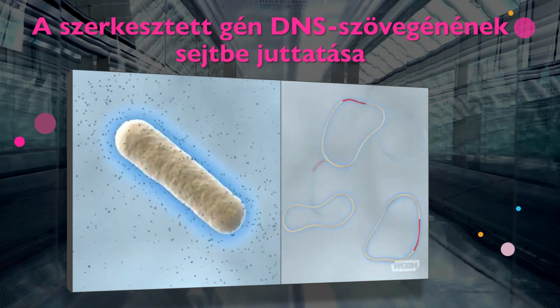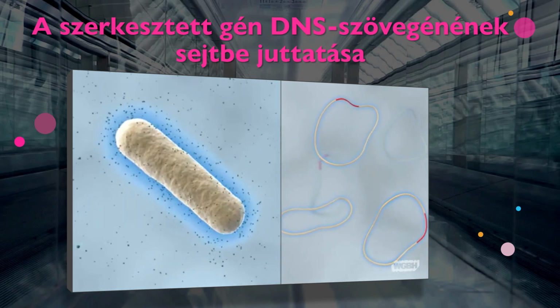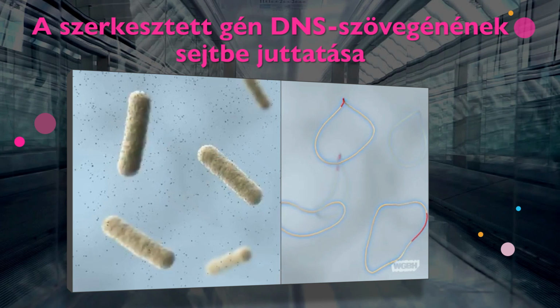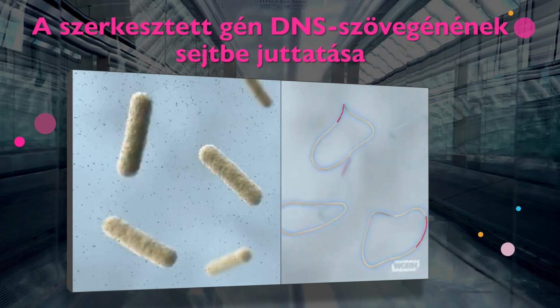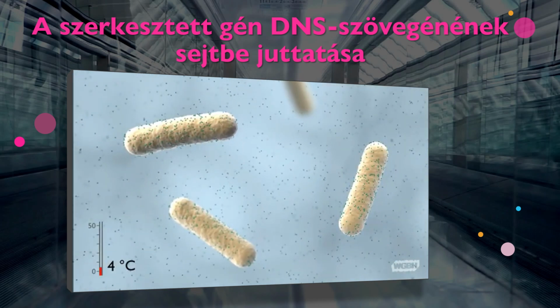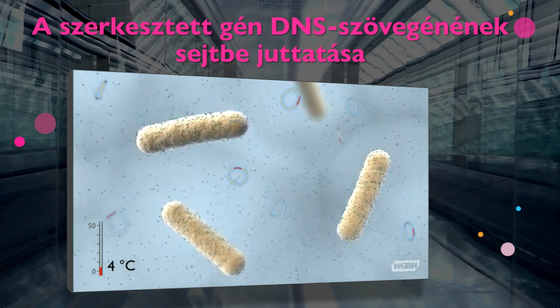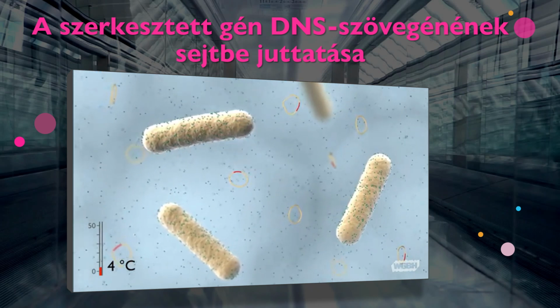Once in solution, the positively charged calcium ions bind to the negatively charged phosphate groups on the cell surface and neutralize their charge. Plasmids containing the gene of interest, RFP, are then mixed with the treated cells at 4 degrees Celsius.